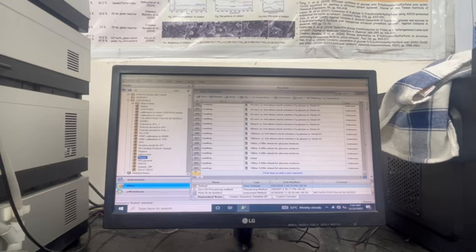So you can see so far I have done around 500 analyses. Actually I'm not using this one actively, Rajiv is using this HPLC actively, so I didn't do that much analysis. So here there is a click, so we'll click on that. Every time there will be another click, so we can give the name here. The name is here already. Like we said previously, our processing method, everything is set here, so we don't have to do anything.